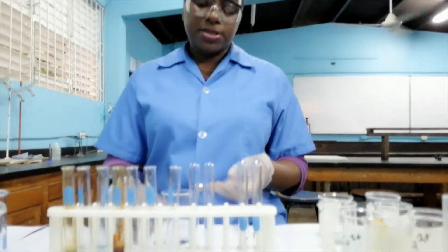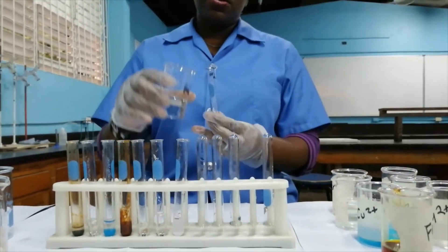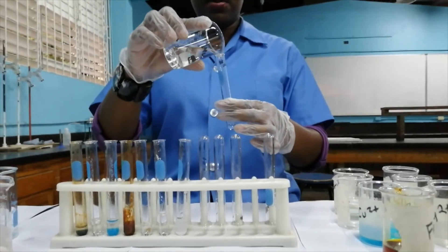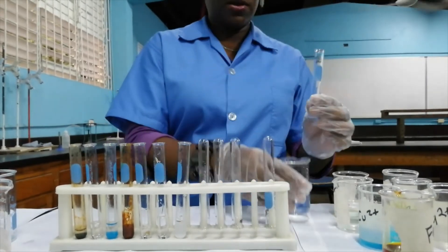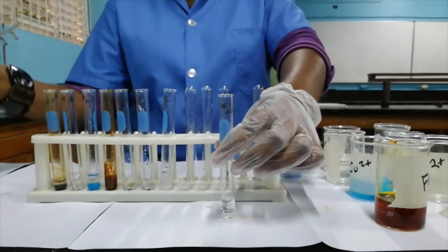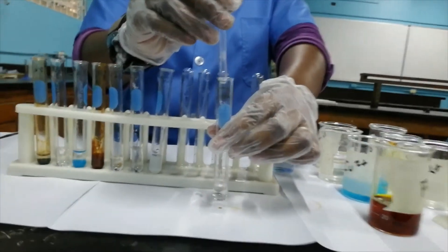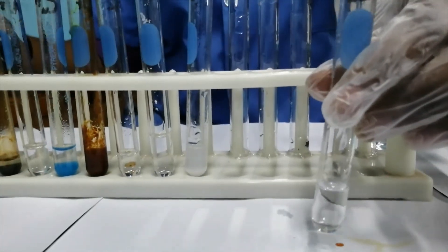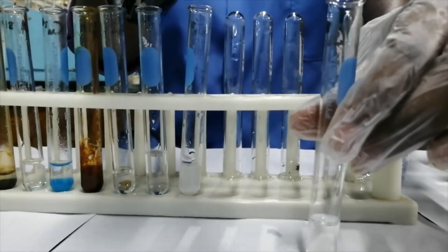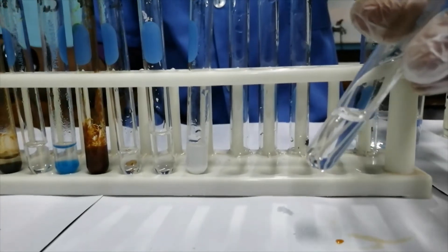We will now look at the barium ion and its reaction with sodium hydroxide solution. The barium ion is colorless in solution — it is an s-block element — so on addition of aqueous sodium hydroxide, we do not have any precipitate formed.